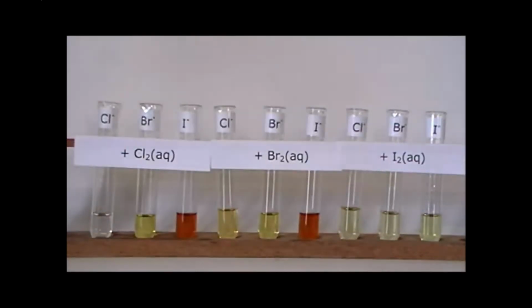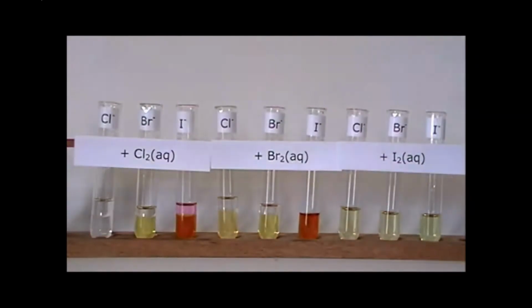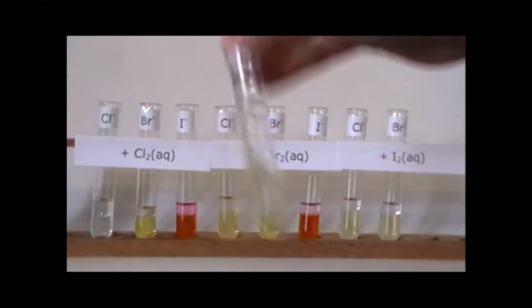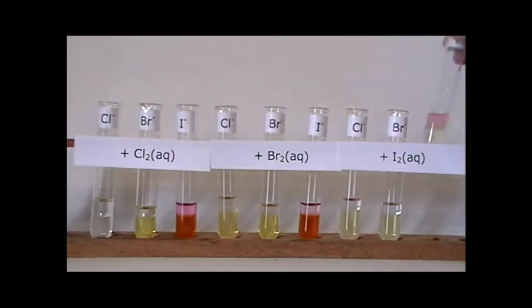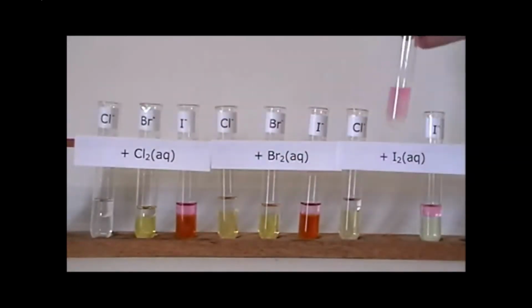The cyclohexane is going to float on top, and he's going to give it a good shake once it's all added. And we're observing the color of that top layer. You're probably going to end up pausing the video to get those colors recorded. Okay, there we go. And he'll do all 9 of them.